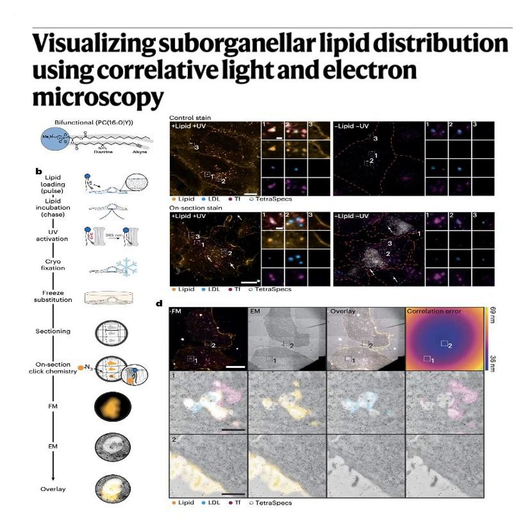First, load the lipids using a cyclodextrin shuttle for exactly 4 minutes. Second, cross-link the lipids to neighboring proteins in 3 seconds using that custom top-down UV rig. Third, freeze the whole system via high-pressure cryofixation in under 10 seconds and wash away the excess. And fourth, click chemistry attaches the glowing tags to the sliced resin so you can finally see them.